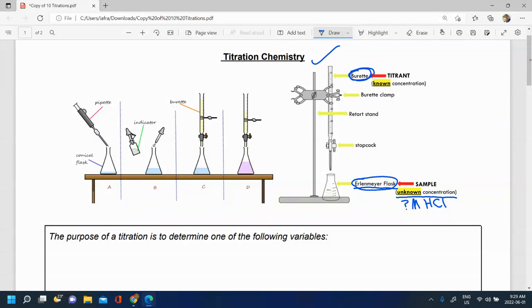Then in the burette, this fancy piece of glassware over here, we put something called a titrant. The titrant is a substance that you know the concentration of. For example it might be two mol per liter sodium hydroxide.